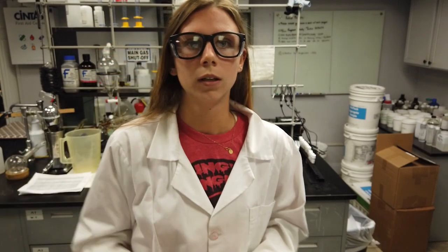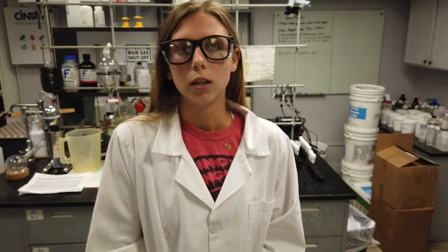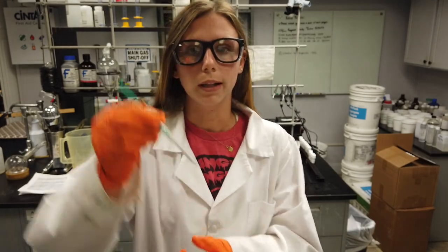To start, obtain a sample of the diluted FirstMate Concentrate solution. Be sure that the solution is well mixed so that the sample gathered is representative of the entire solution. Use the provided syringe and add 1 mL of the sample to the vial.